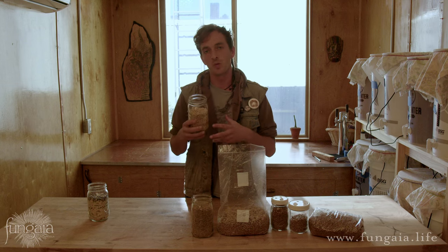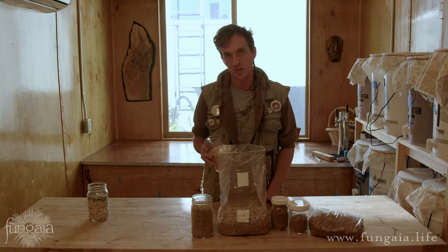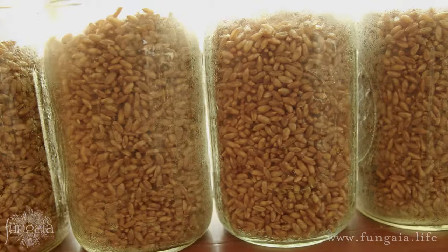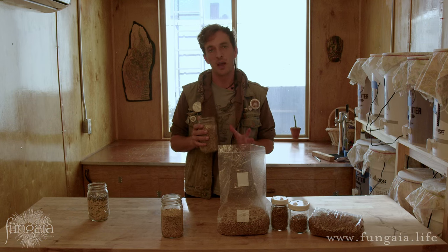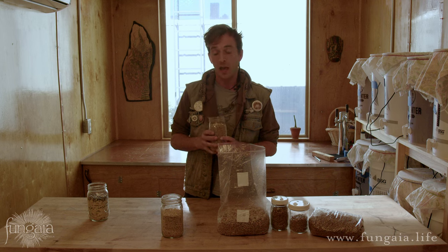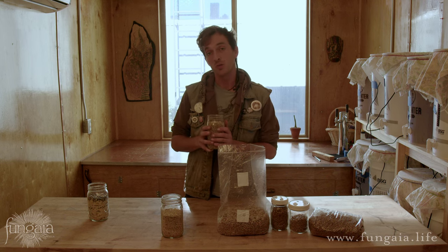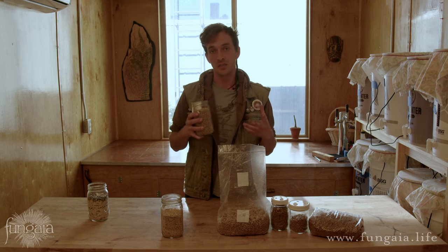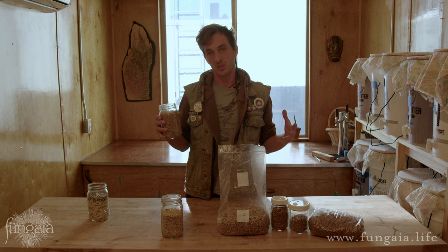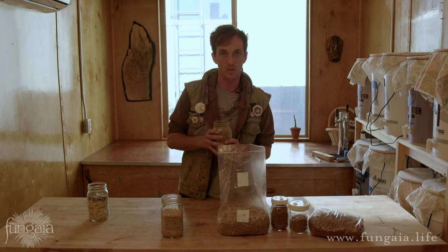These smaller grains also more readily absorb moisture, so they don't require quite as much preparation as rye. Rye is my personal favorite — there's very little that can rival the nutritional density of rye. However, it does require a little bit more care in the process. I'm going to use rye to demonstrate a good way to prepare grain spawn because it gives you the most tools, which you can then use to refine your own process and maybe cut some corners.